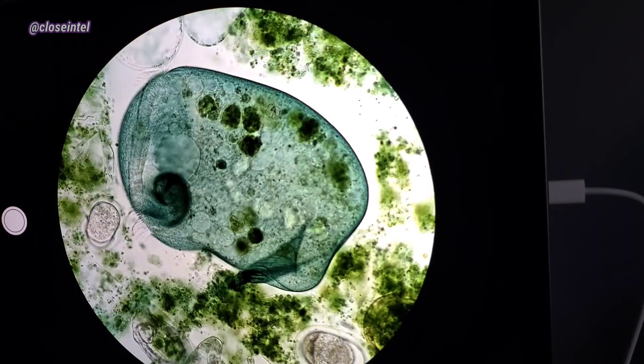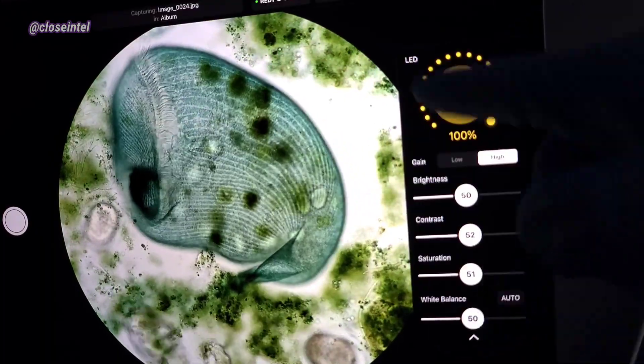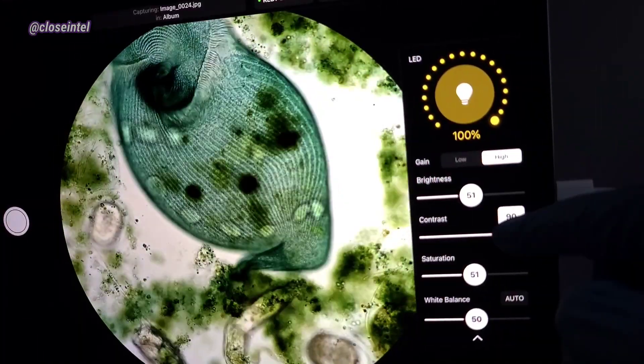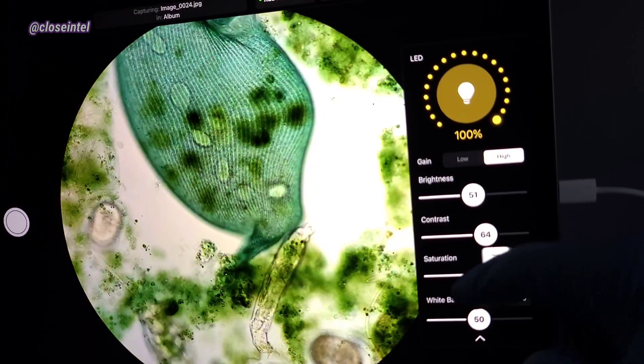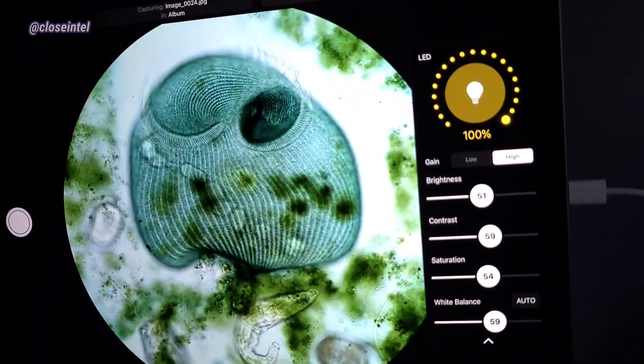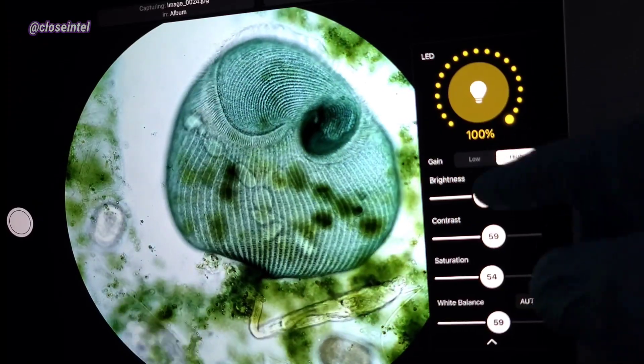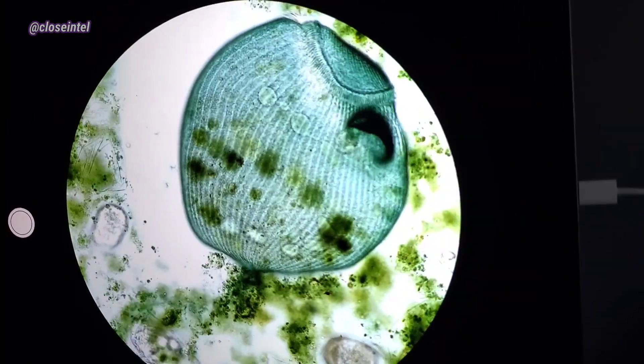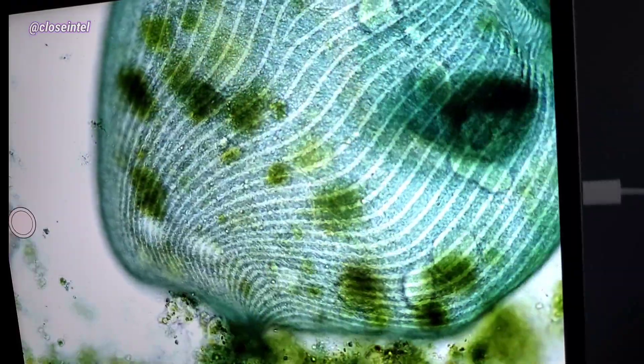It also has some software capabilities that you can use while you're looking at specimens. You can increase or decrease the intensity of the LED, the brightness, contrast, the saturation, and it even has a white balance feature. There's also high gain and low gain along with being able to zoom in or out to see better details.